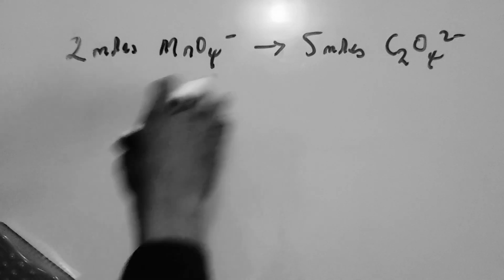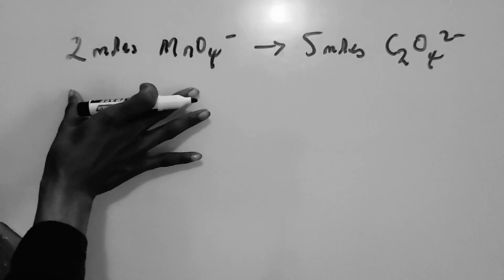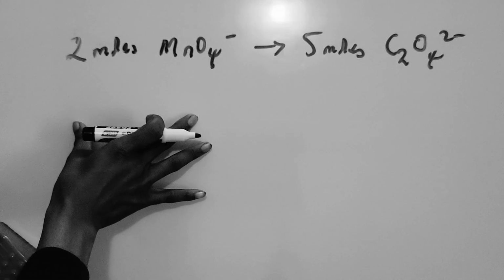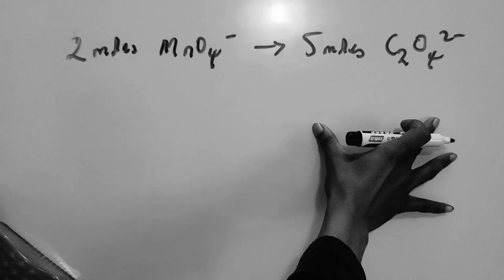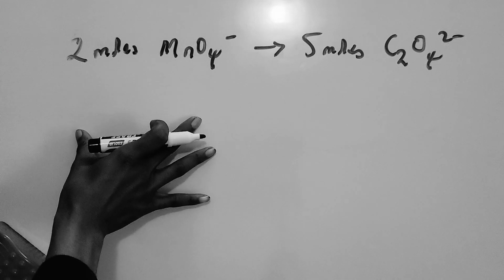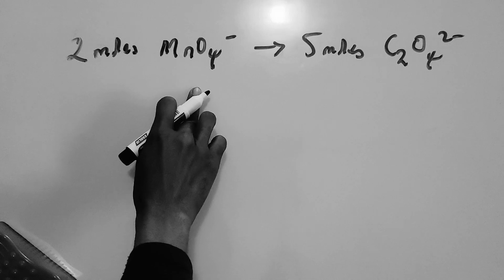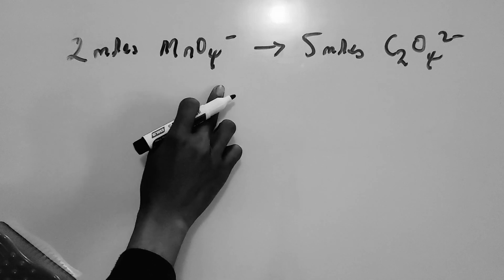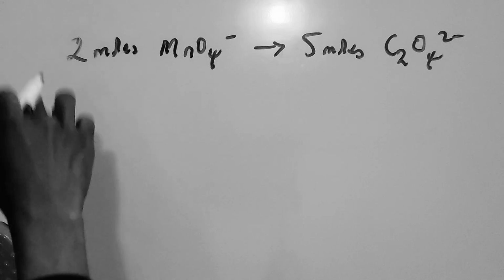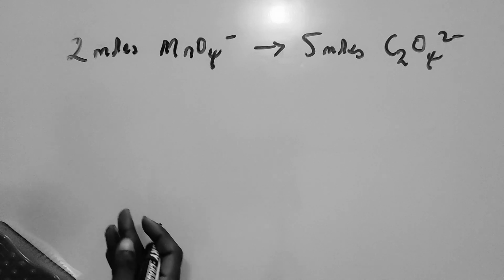Remember, we want to find the molar concentration of solution A. What we just did, we are repeating it again. So this is number of moles, volume times concentration of the permanganate, and volume times concentration of the oxalic acid. Remember, we now know the exact concentration of solution B. So what was the volume here? In the first table, what was the average volume of permanganate that was used?